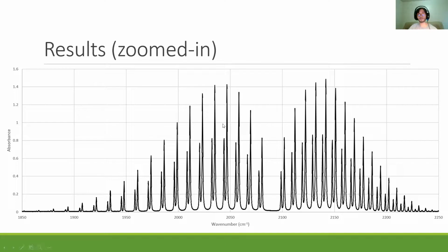Now, right in the middle here, you have our Q branch, which is J not changing, which is forbidden by our model. Now, Nick, you might be saying, the overtone transitions were also forbidden, but we still saw them. So what's that about? Well, as I said, we deviate from our harmonic oscillator model more than we deviate from our rotational model. So that deviation allows the overtones to exist and be measured, but this doesn't for this particular molecule. So we just don't deviate enough to see the predictions becoming incorrect.